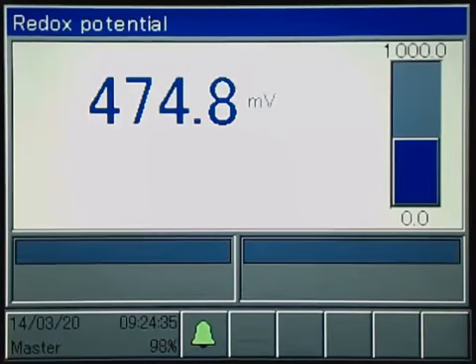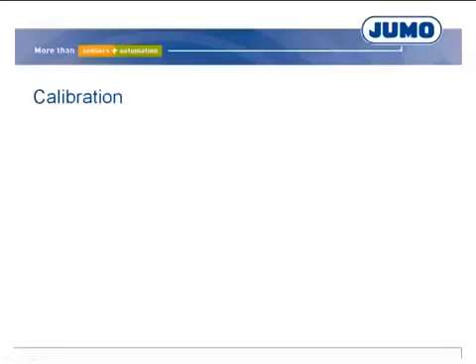These settings create the shown detailed screen. A calibration at the start of the measurement, as in the norm for pH measurements, is not required. The electrodes can be used immediately.